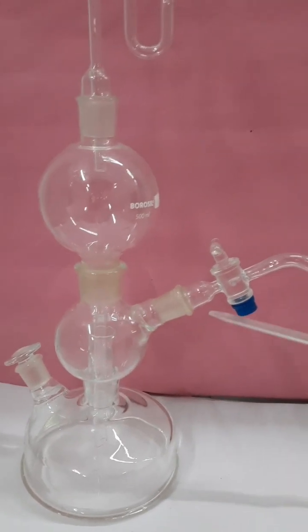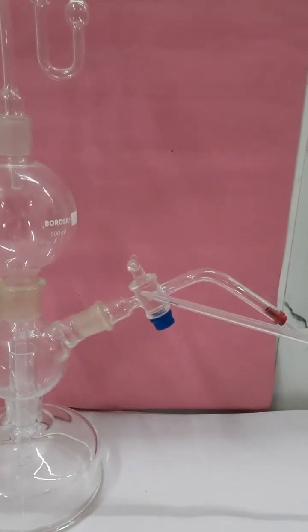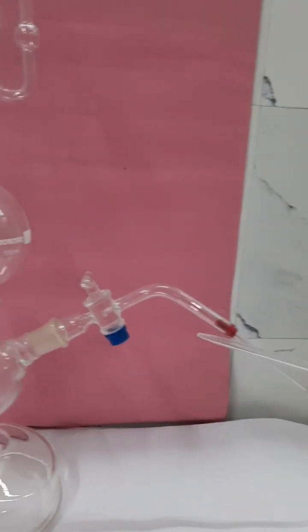Here is a stopcock to release the gas prepared in the middle chamber.